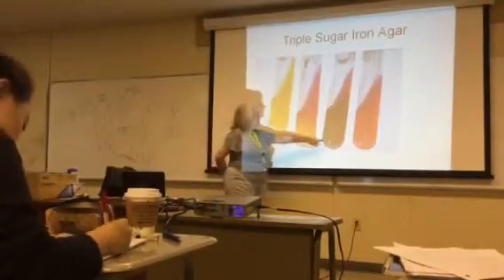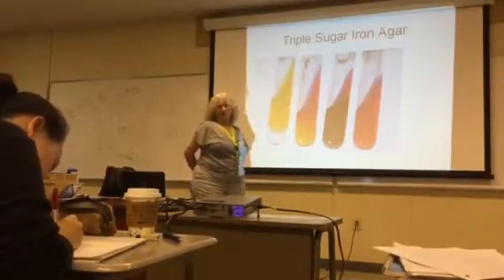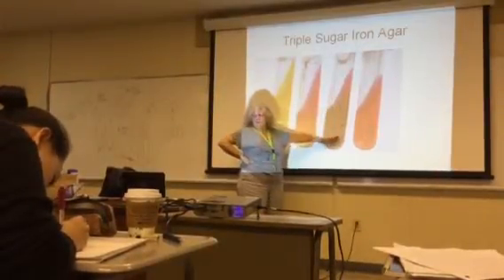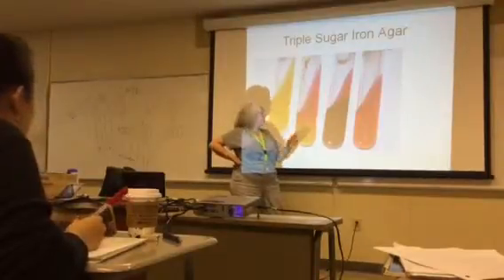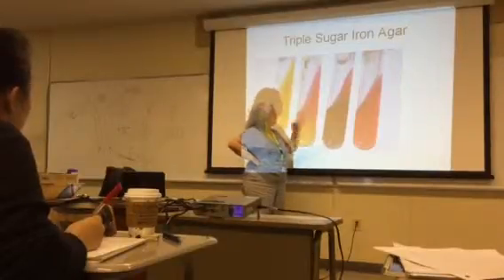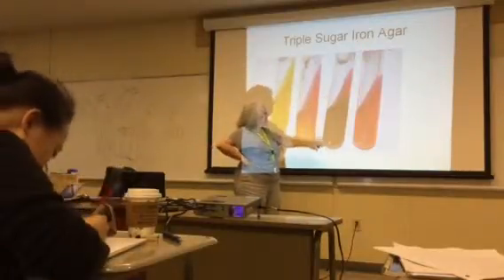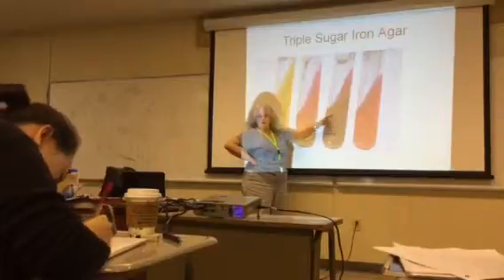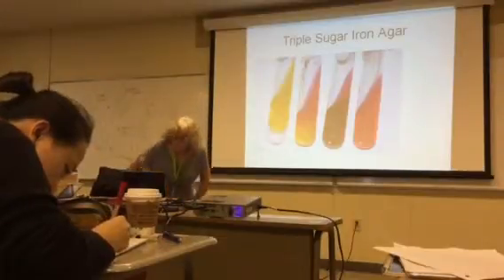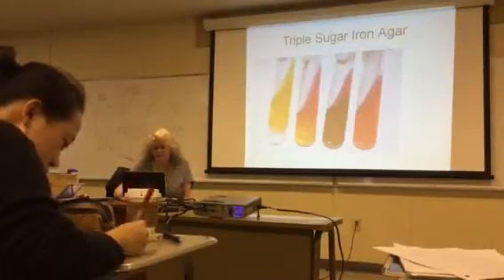Now look at this one — it's black. Anytime you see black in your media, that black precipitate indicates hydrogen sulfide production. You can assume the butt would be yellow if the black wasn't there. So this organism was also a glucose fermenter, but at the same time it was able to produce the hydrogen sulfide precipitate.